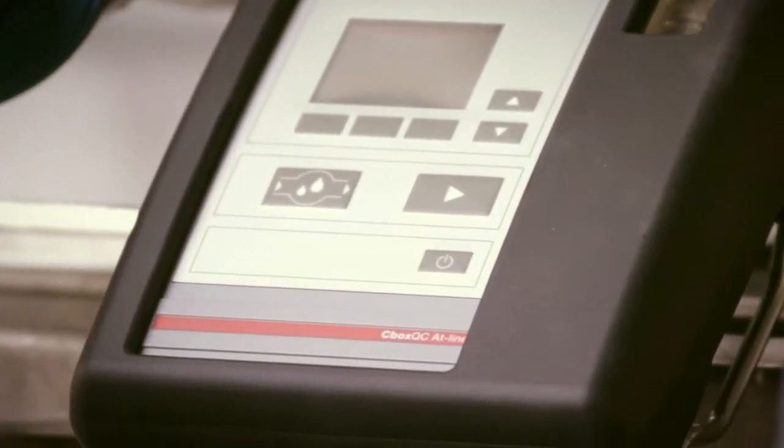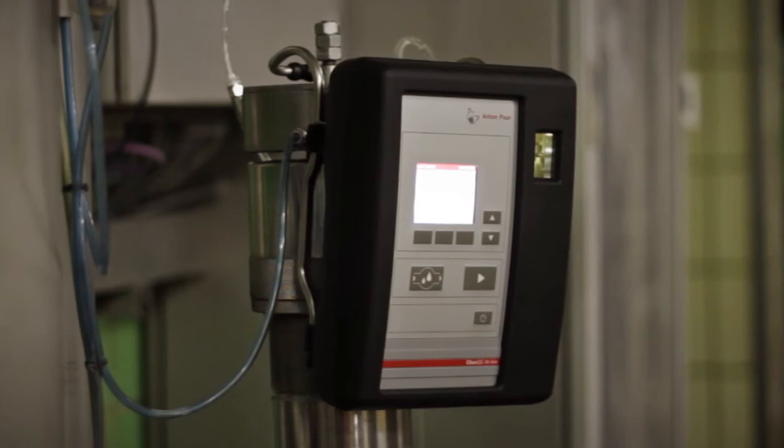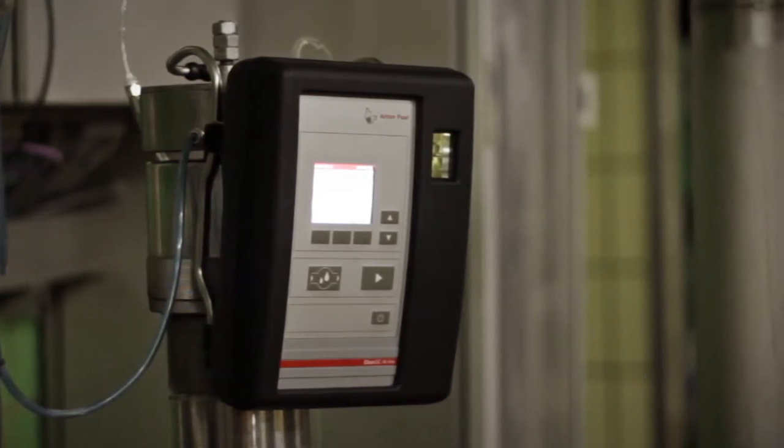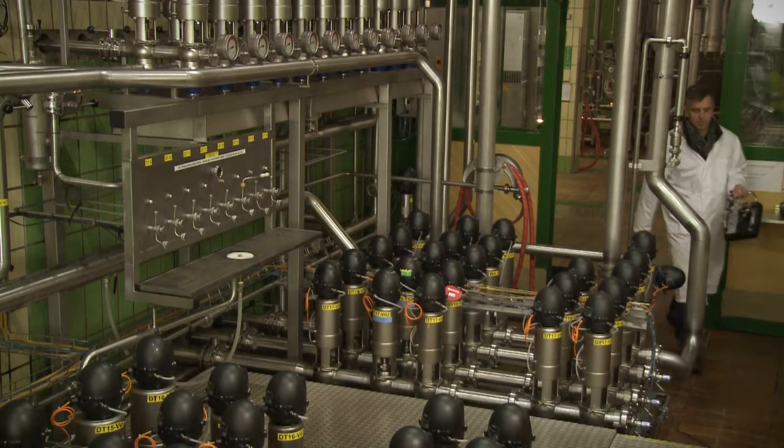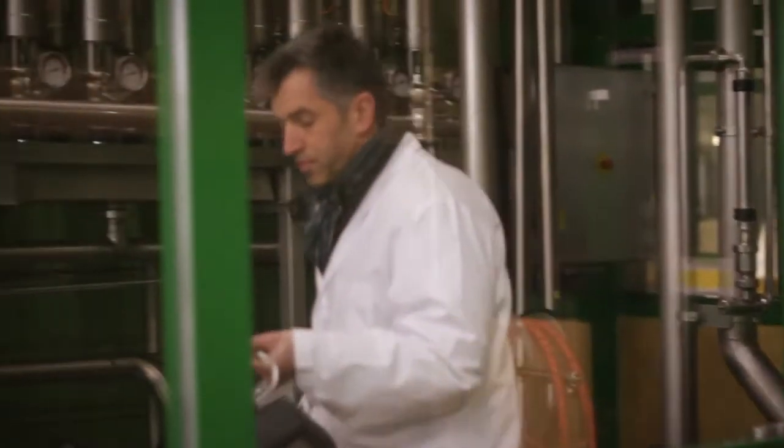Cbox QC ATLINE is a very versatile instrument. It can be used at different sample points like in the filtration process, at bright beer tanks, filling lines or tankers. Perform the following steps for reliable and correct results in the process environment.